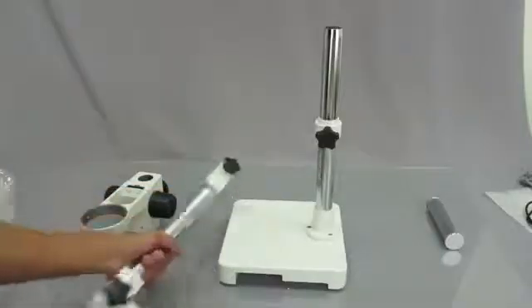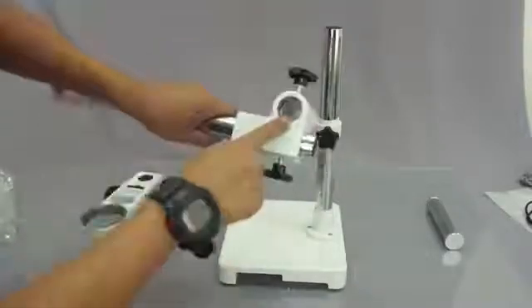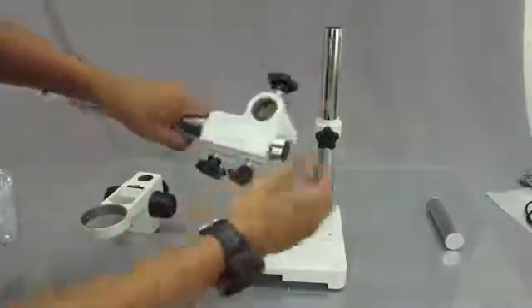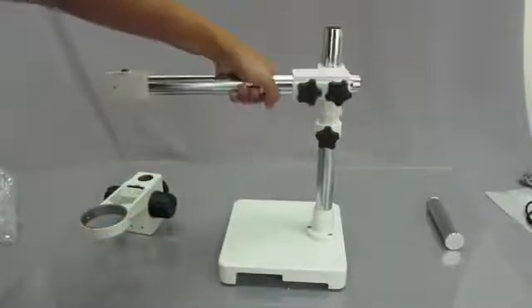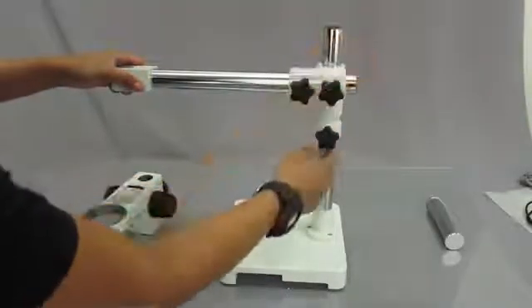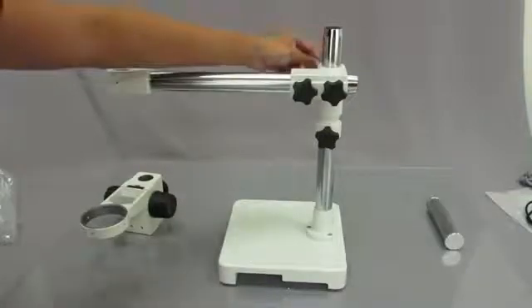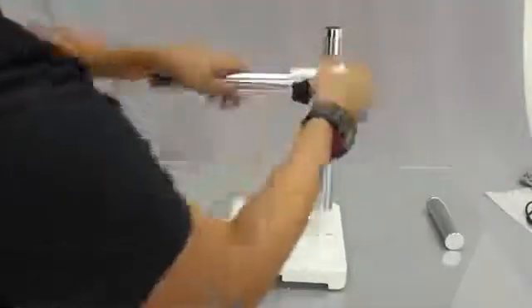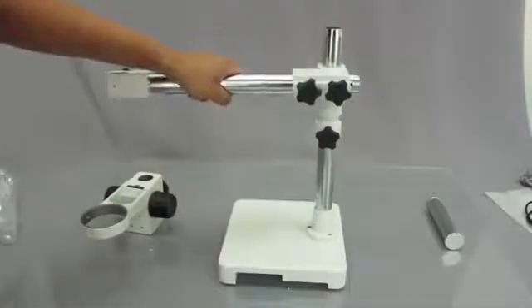The next thing you want to do is get the arm of the microscope. The part that you want to place on top is the part with these two knobs here and this one knob here. Make sure that you unscrew it a bit so that there's nothing blocking it, and slide it right in. As you can see, because I tightened this earlier, the part isn't falling down at all. After you place it, all you have to do is tighten this knob in the back, and then this won't swivel around and move around. See, it's a little bit tighter now.